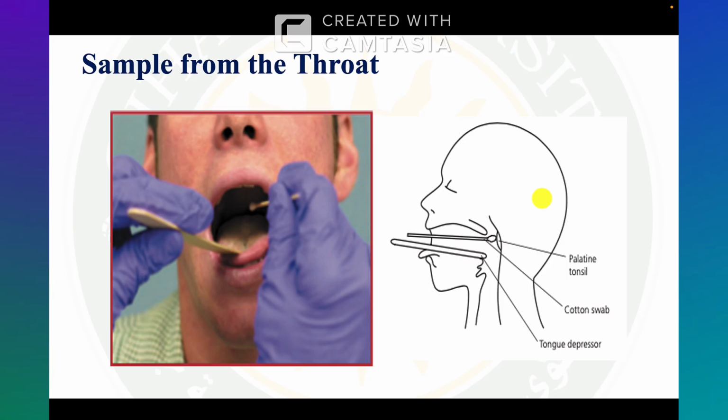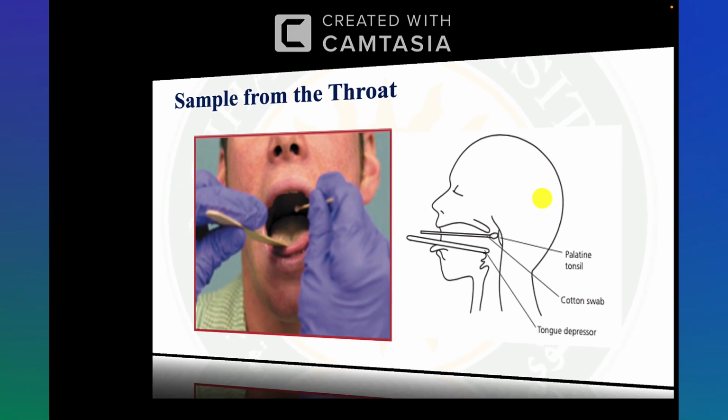Maybe it will grow, because Streptococci from the throat are normal flora. If it is not pathogenic, you will have maybe just greenish growth on the media. But the pathogenic is hemolytic, of course. Or maybe you will find hemolysis like beta or gamma from these samples which you have taken from your friends.